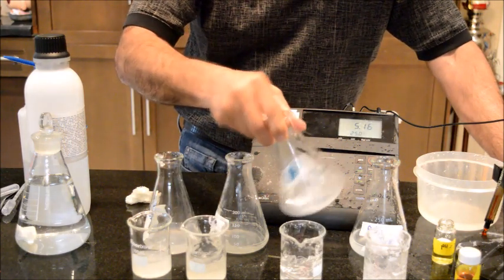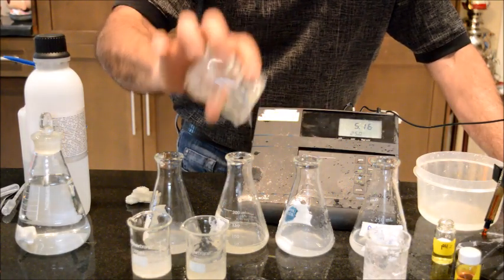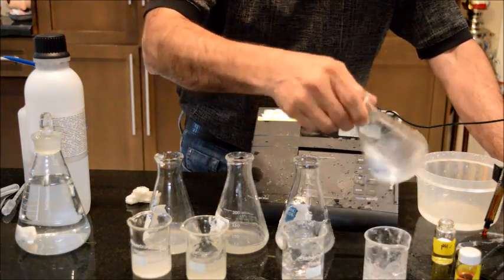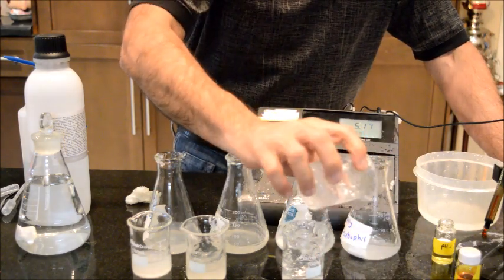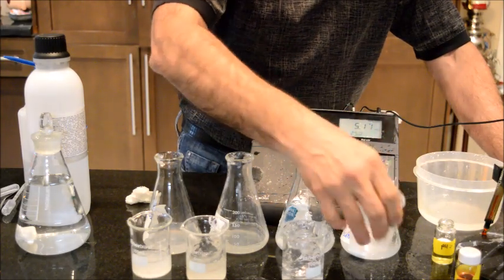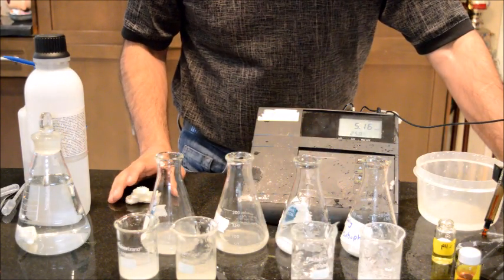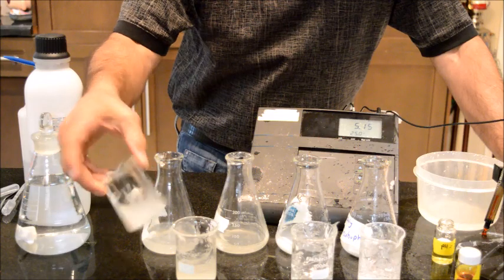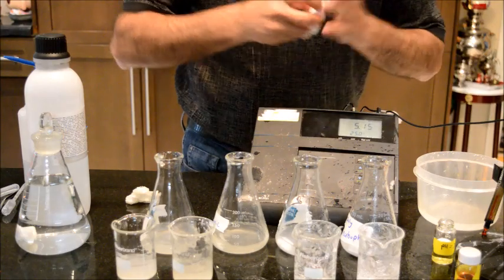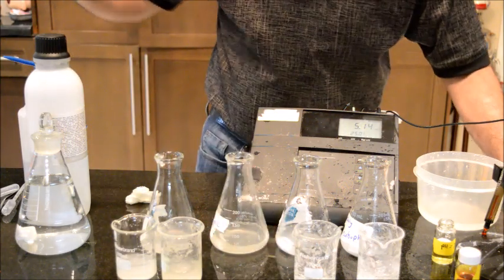Carbomer was kind of liquidy or fluidy, and when it is adjusted, it definitely is not going to come. Oh, it came a little bit, but it is a very thick gel. And Carbophil again was liquidy, and again I'm not going to rock it this time, but this forms a very thick gel. So if you are going to make your vaginal suppository, probably this is how the viscosity of your product is going to be, that you will use your applicator and then you deposit this in the body cavity.